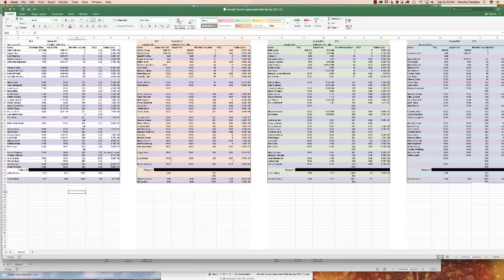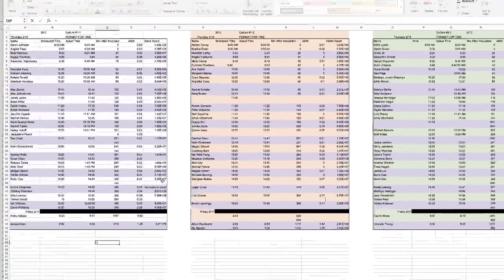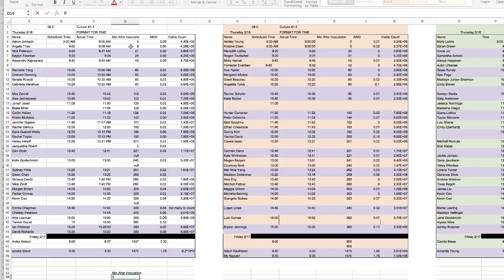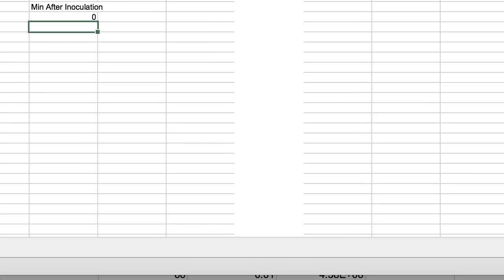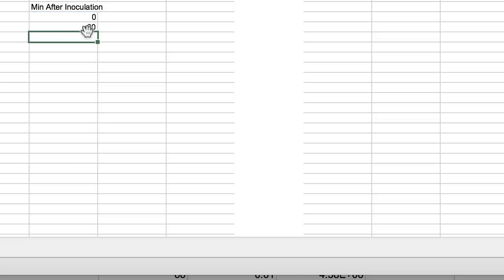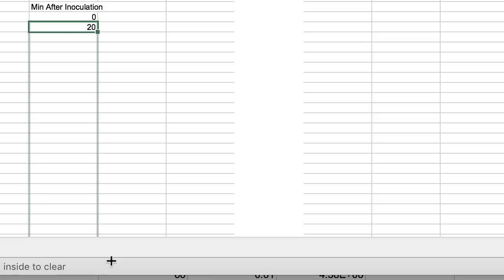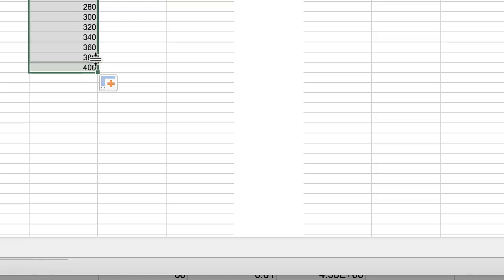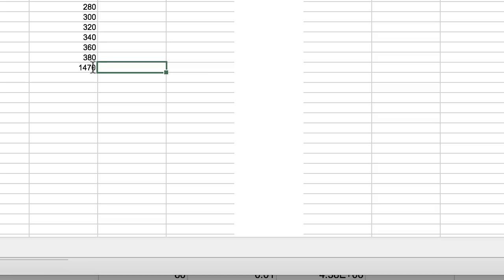To set up the time column, type equals and click on the first cell to transfer the value. For the next cell, type equals, click on the cell, and add 20 minutes — that's what it was supposed to be — then drag it down until you get to 380. That's 400, so drag up a little. That's 380, and for the last point just type 1470. Now we've got those time points.